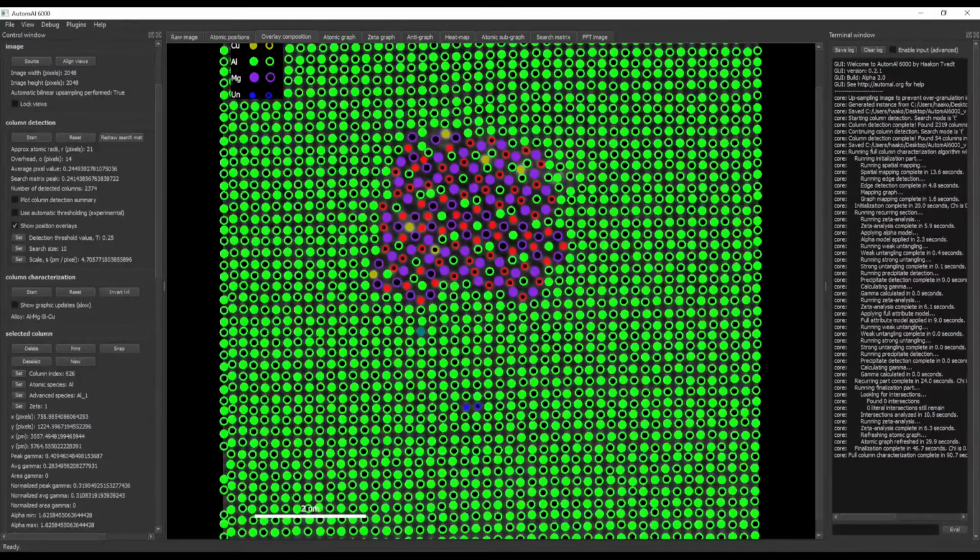It maps the relationship between the columns, which is important information. And this is mostly for the algorithm, but it turns out to be a very useful tool to review the results as well, because just looking at this, even though it looks kind of okay, for bigger precipitates you can't sit and check every single one.